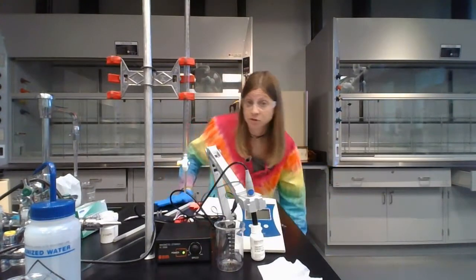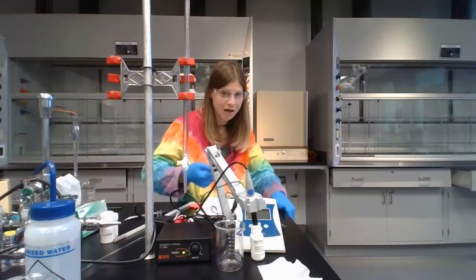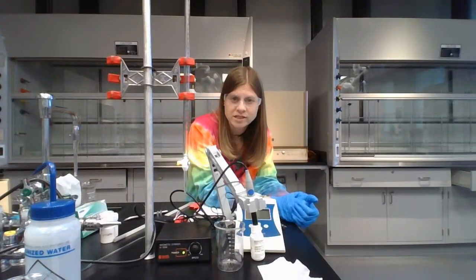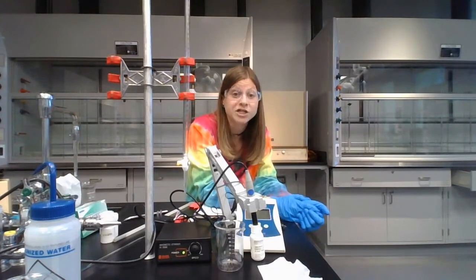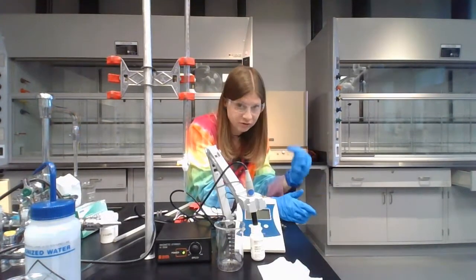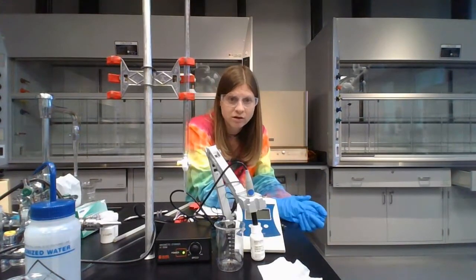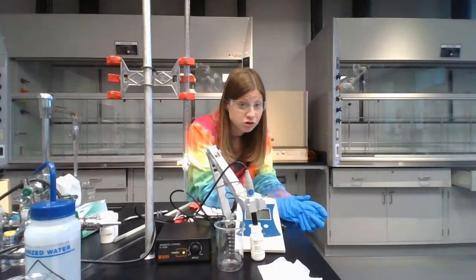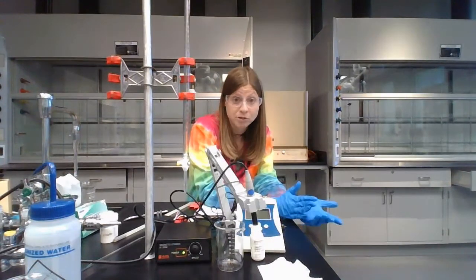So I'm going to make up numbers. I don't know what yours are actually going to be, so don't expect yours to match this. But let's say at 21.00 milliliters, your pH value was 4.3. And at 22.00 milliliters, so a difference of just 1 milliliter, it went from 4 point whatever to 9.6. So it jumped by 5 pH units. You're going to have something like that, a big jump. Mine in my pretend world was between 21 and 22 milliliters.